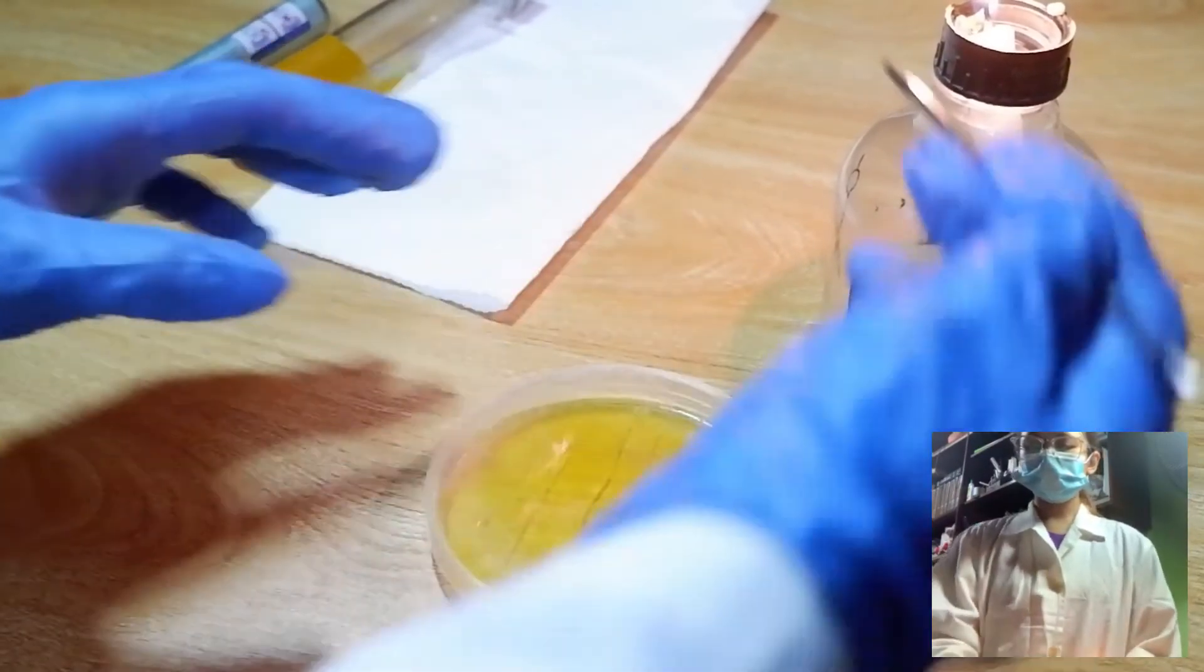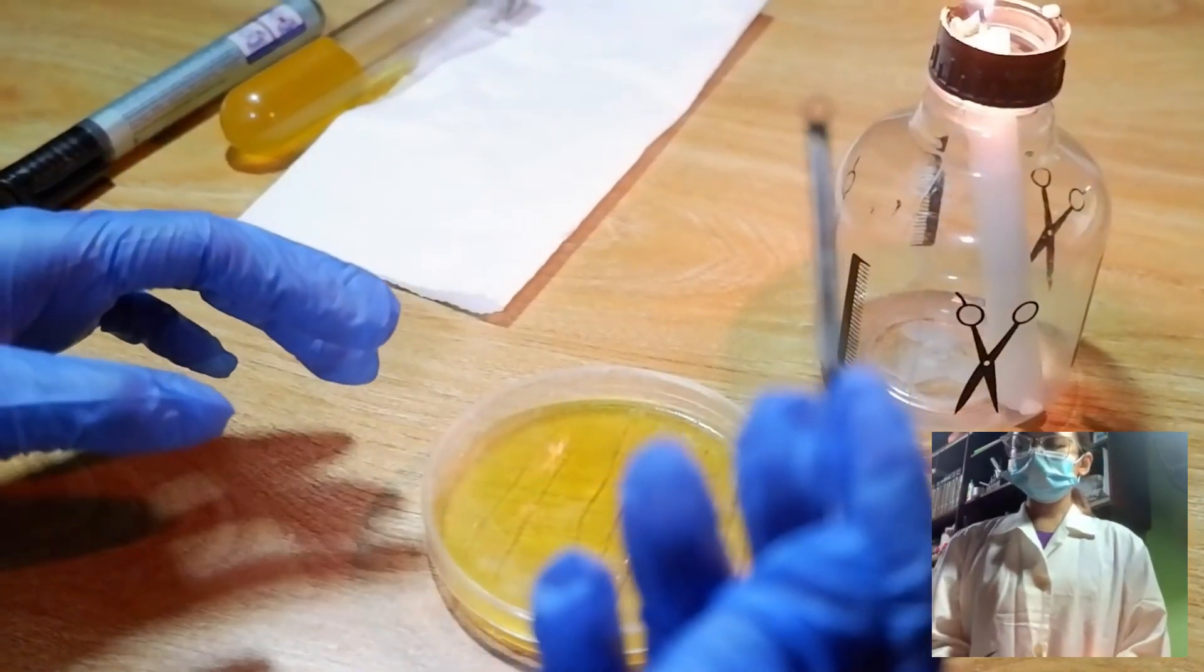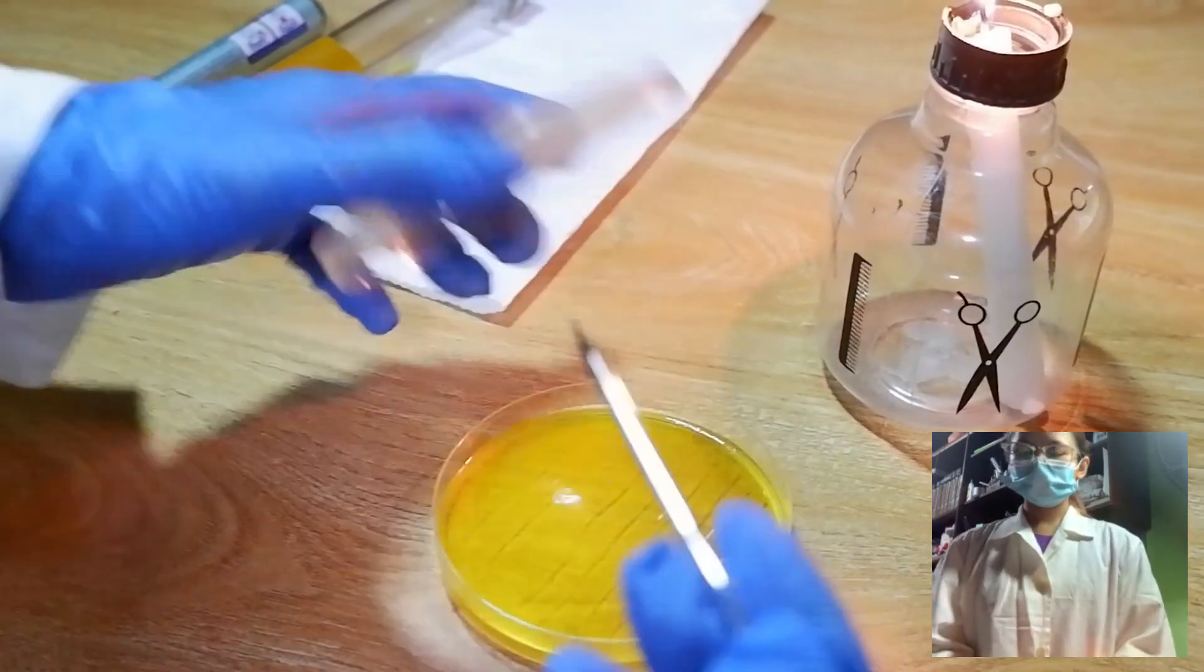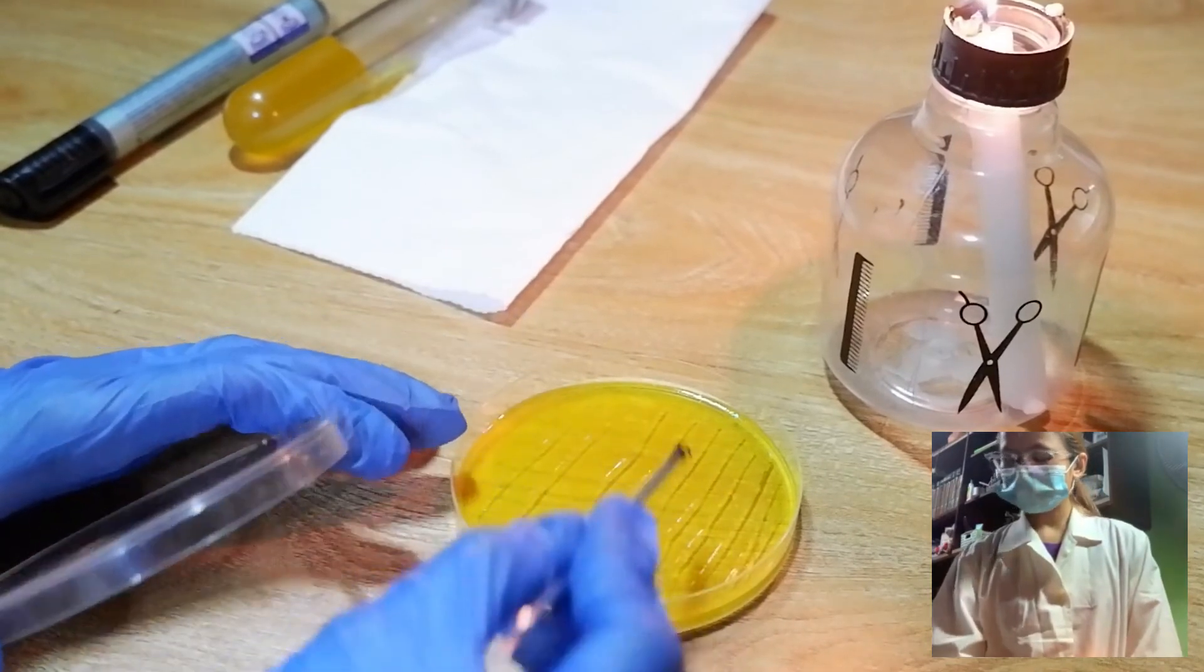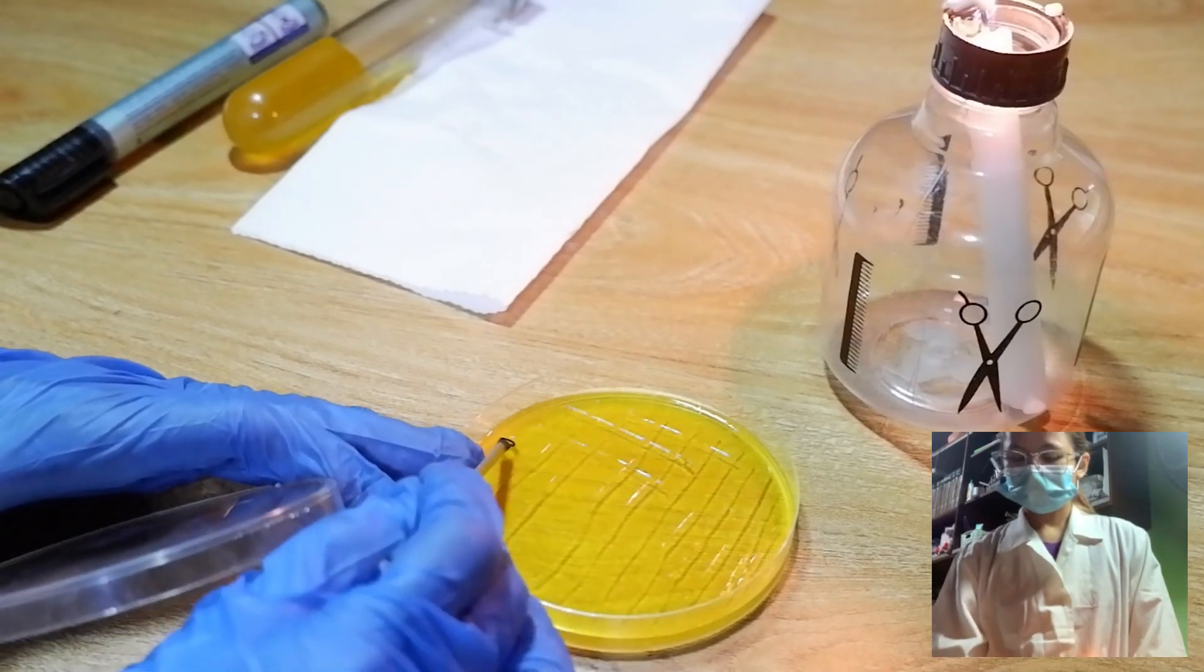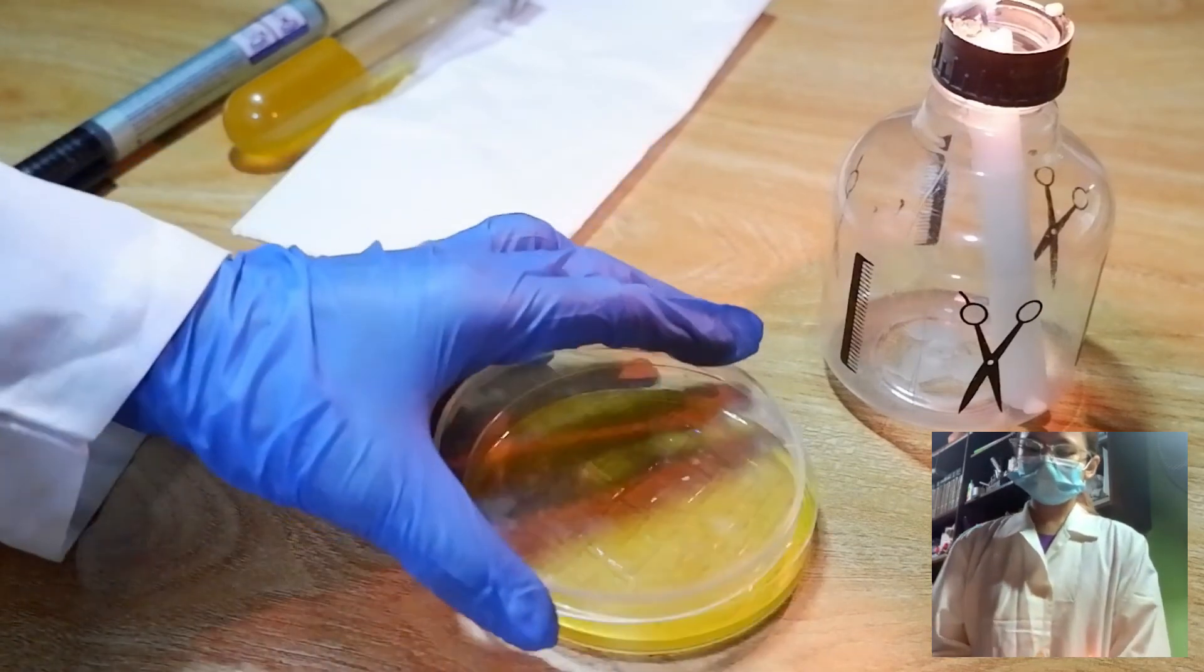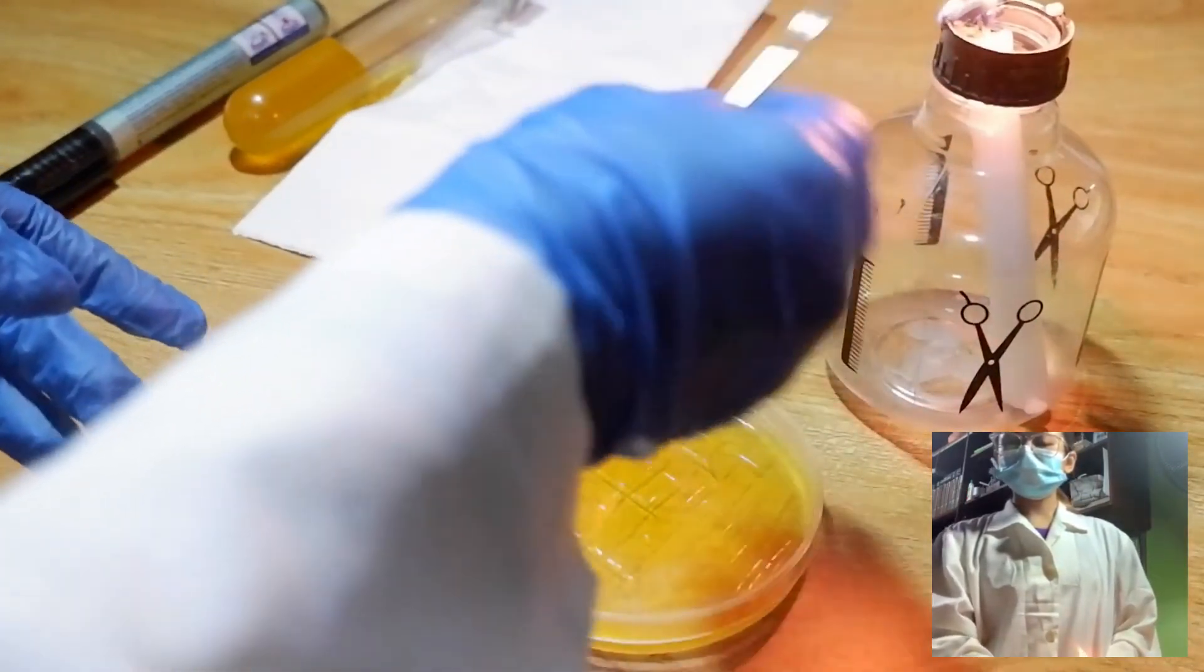And then, flame the loop again and allow it to cool down for 5 to 10 seconds. Now, we will cross streak over the last group of streaks. So, cross. Flame the loop again before putting it down to sterilize.